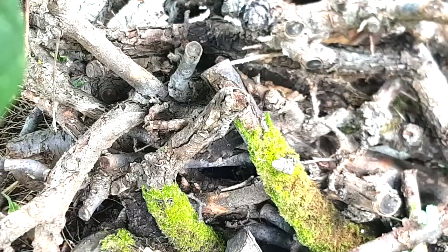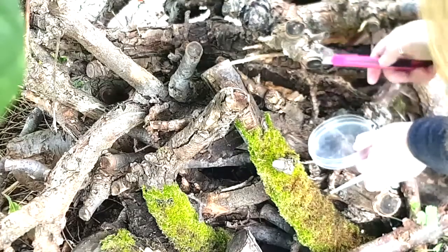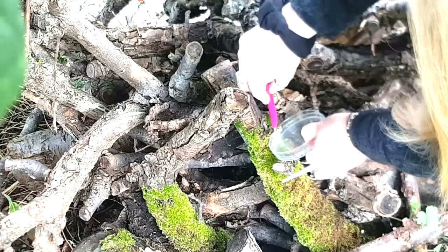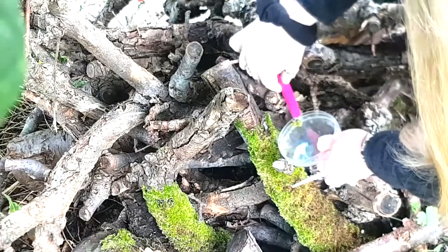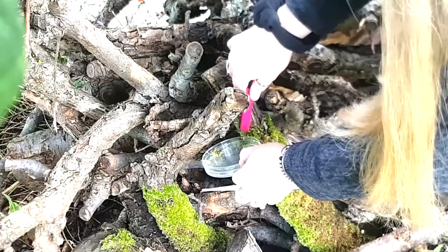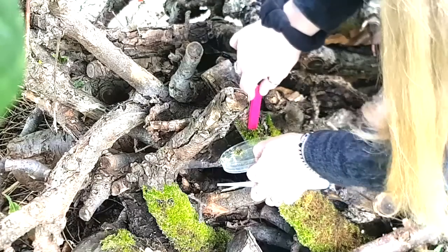Okay, so these are some of the branches that are covered in moss. I'll try and do this without blocking the view on the camera. So all you do is just get a dish of some kind. I'm using a petri dish, and then you use the blade and you just basically scrape some off and collect it. You can use wet moss or dry moss. Just basically want to collect a few little scrapings of this into the dish. I try to scrape as close as possible to the wood.